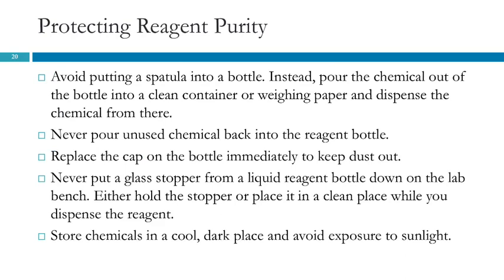And then these are some good practices for protecting your reagent purity. Because once that bottle gets opened, things can happen. And so we need to treat the bottle correctly so that it can be used again in the future. When you are concerned about reagent purity, you should avoid putting a spatula into a bottle, even if you think the spatula is clean. The proper technique is to pour the chemical out of the bottle into a clean container and then weigh it out of that. When you're finished with that, you do not put that back into the original reagent bottle.